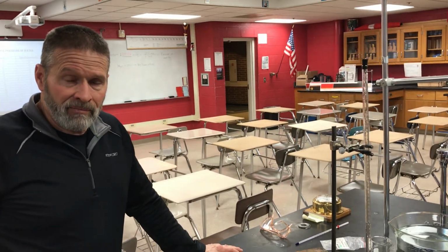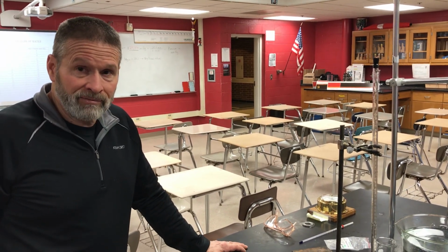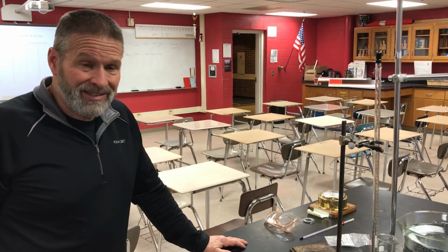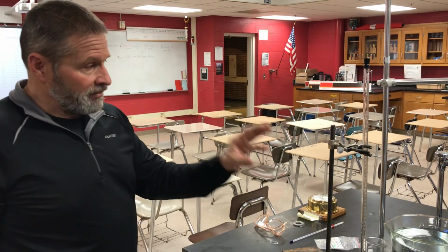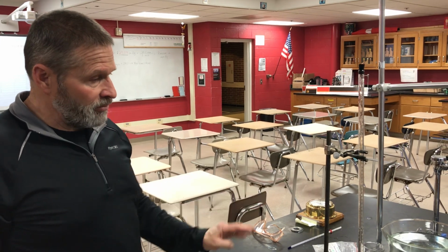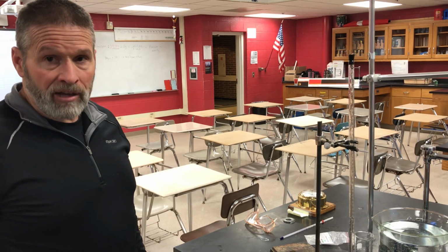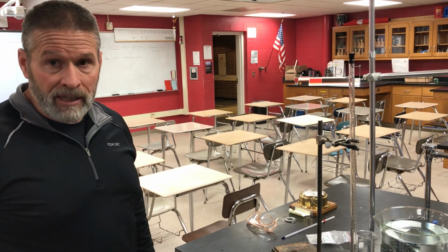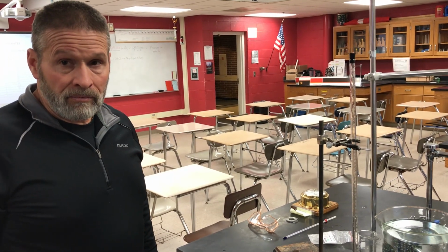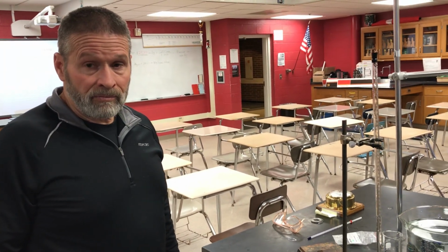Does everybody remember standard temperature and pressure? Remind us, Mr. Hevel. For gases, 273 Kelvin, and standard pressure, 760 millimeters of mercury. So again, you'll have to take the data that you have here for your volume, temperature, and pressure, and use the combined gas law and see what the volume of hydrogen would be if we were at STP conditions. All right, so let's see how we do for a percent yield. Were we close?